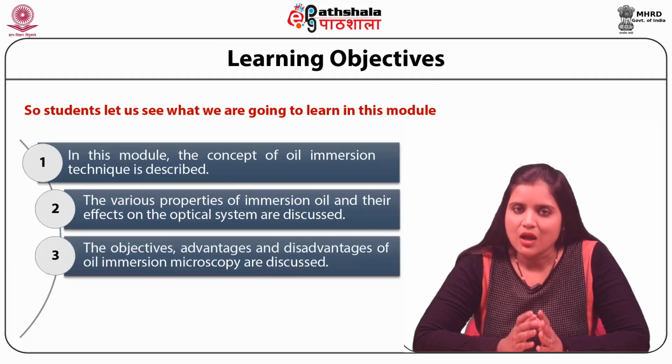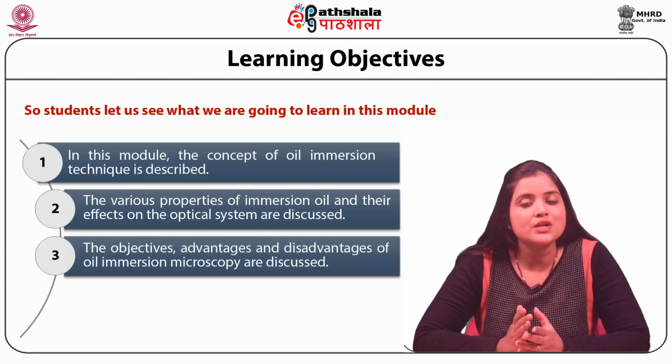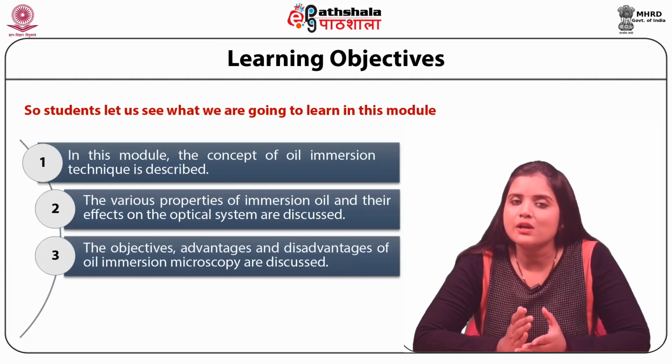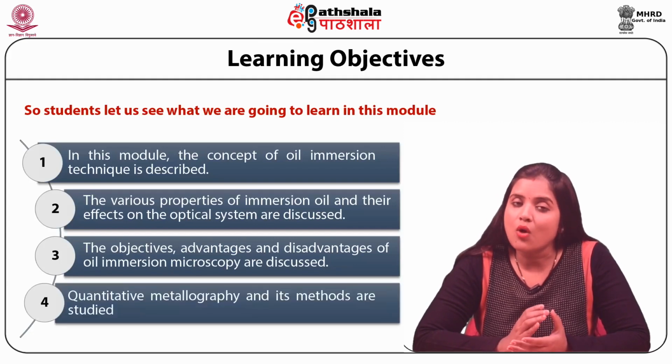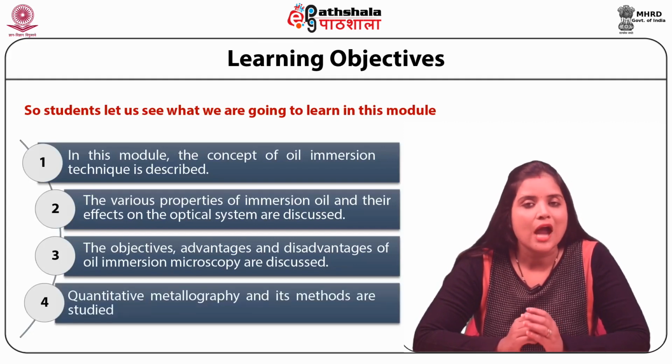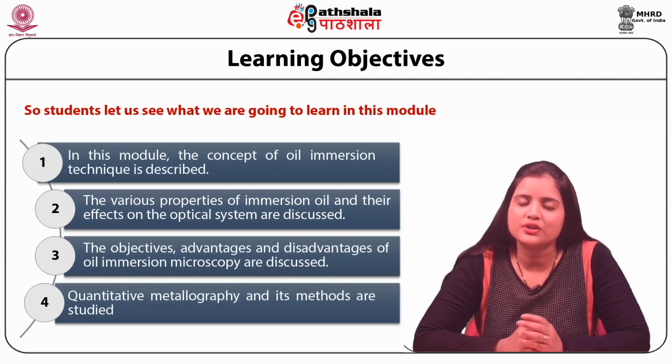The objectives, advantages and disadvantages of oil immersion microscopy are discussed in this module. The quantitative metallography and its methods are studied here.